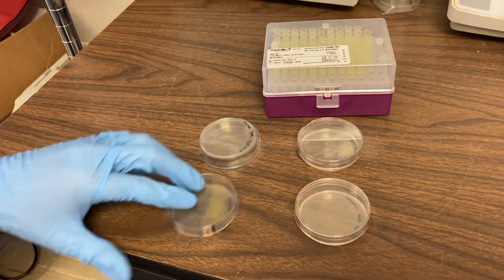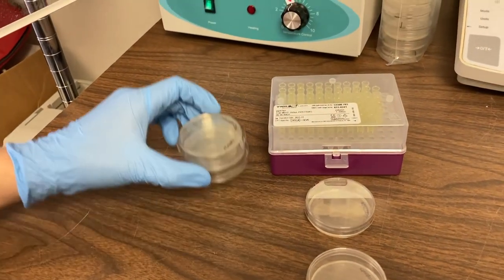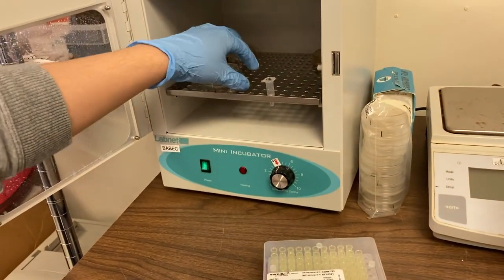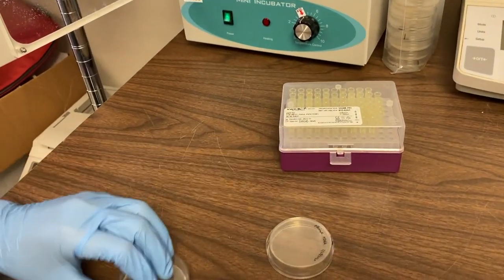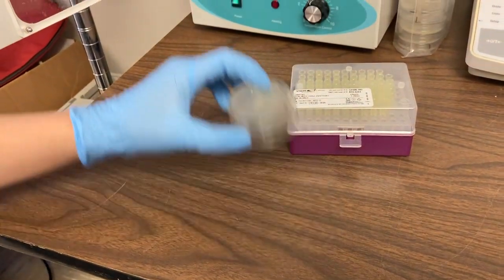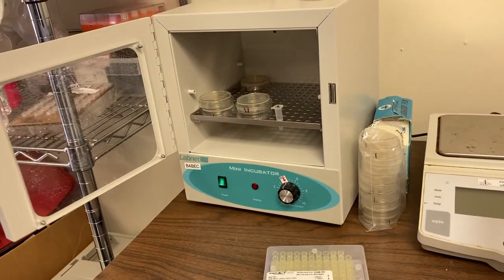Next, we'll turn the plates over and put them into a 37 degrees Celsius incubator. And we're going to leave them there overnight. When we come back, we'll be able to look at the results from our bacterial transformation.